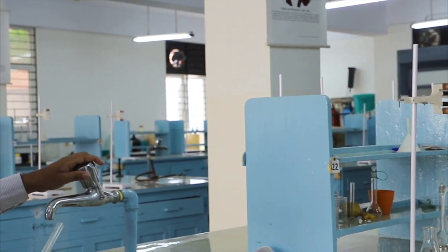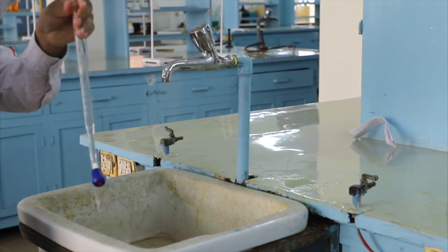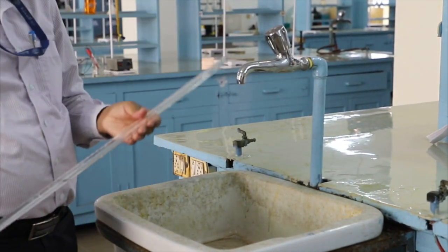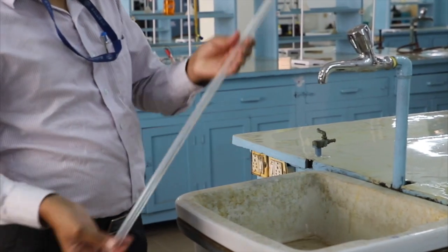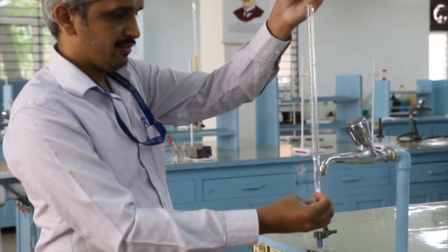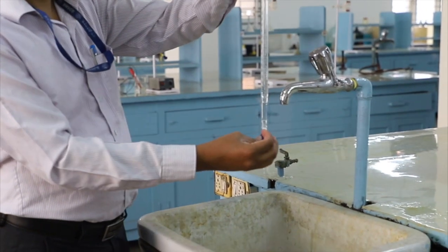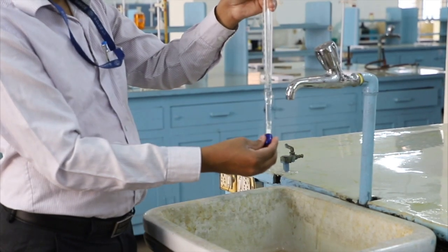Generally washing is done using tap water. For example, if it is a buret, you can use tap water and thoroughly wash it. The tip of the buret also should be washed, and you can properly wash all the parts of the buret. The same thing is true for conical flask as well as pipettes, and also for standard flask.